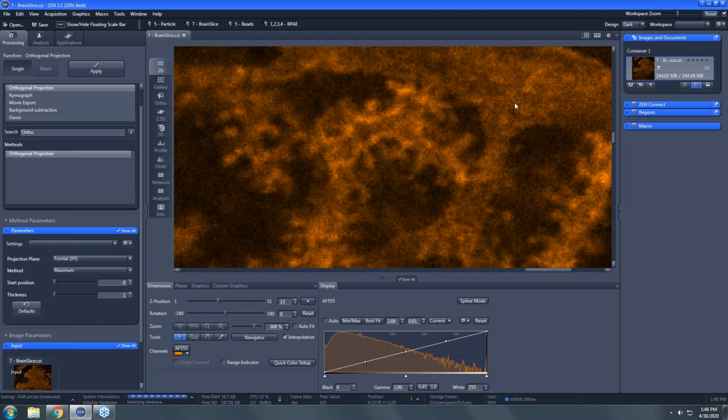Okay. So we start to see here that there's a lot of noise and local variation. I mean, clearly non-biological variation here of some sort, right? And it's just a matter of how many photons we have to work with. Almost any image you zoom in to this degree, you're going to see some of this kind of choppiness through it. How is it that we can improve that beyond what we have now?